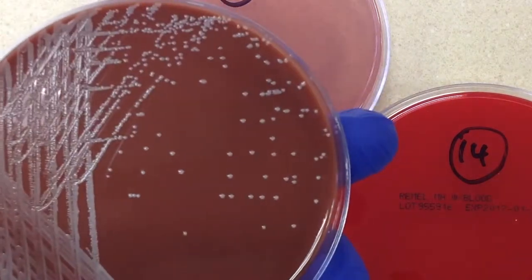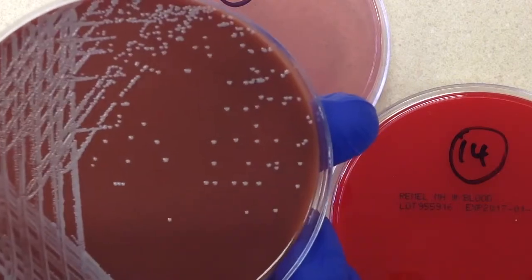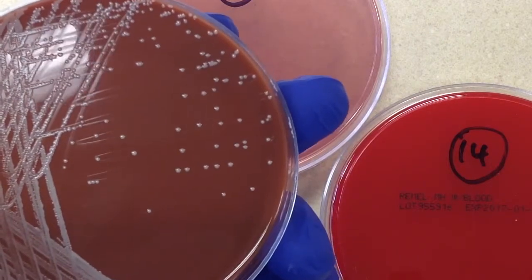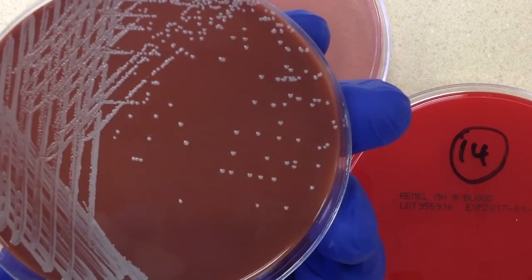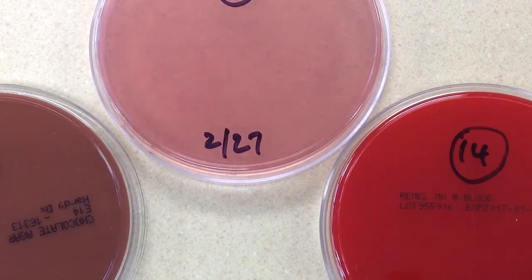My preliminary report: with blood cultures, we don't quantitate as few, moderate, or many — just the presence of the organism is enough from this culture type. My preliminary report will read: probable Staphylococcus species — identification and susceptibility testing to follow.